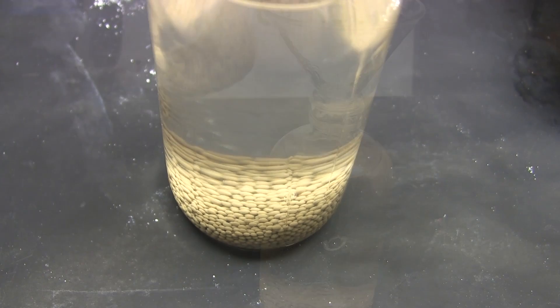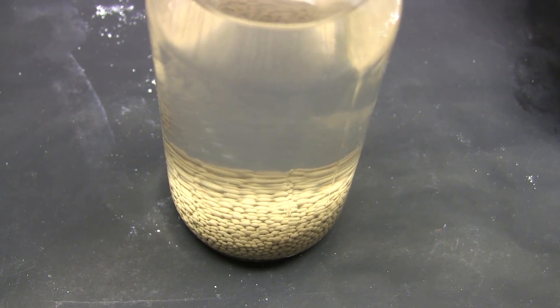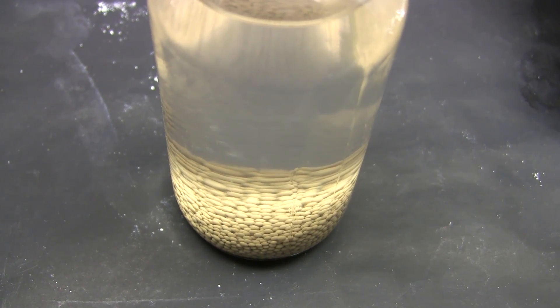There might be some sieve dust suspended in the solvent. This is not a problem for most reactions, but if you want you can filter or distill the dried solvent again just before use.